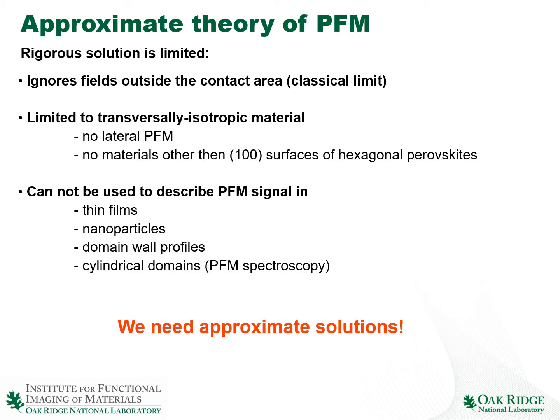Now, what about approximate theory for PFM? The rigorous solution that we discussed above is very limited. First of all, it ignores the fields outside of the contact area. This is a classical approximation in contact mechanics. Secondly, it is limited to the transversely isotropic material, meaning that we don't have any lateral PFM, and practically it doesn't apply to any material other than 100 surfaces of the perovskites.